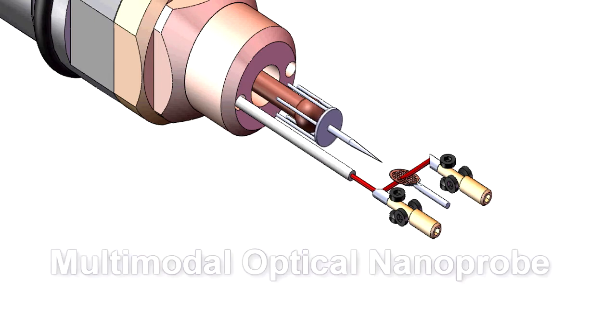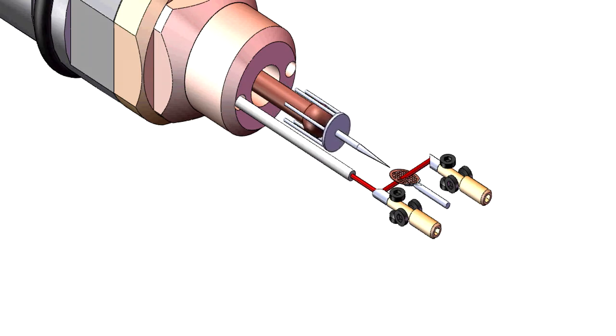Dr. Jonathan Rameau explains. Hi, my name is Jonathan Rameau, I'm a postdoc here at Brookhaven National Laboratory and I'm talking to you now from the electron microscopy lab.